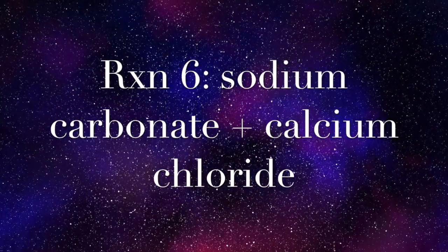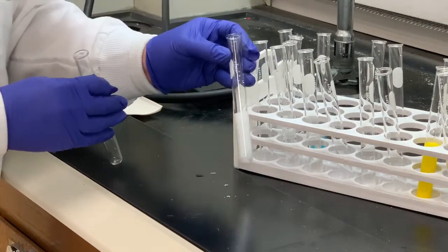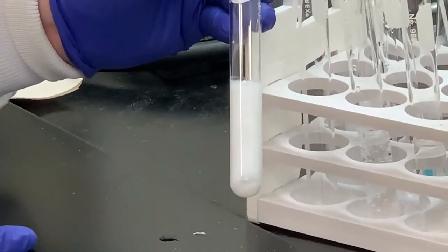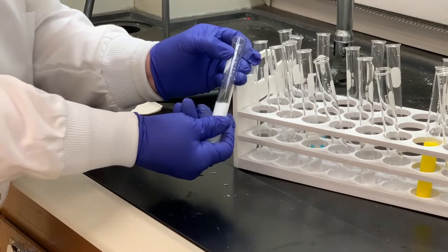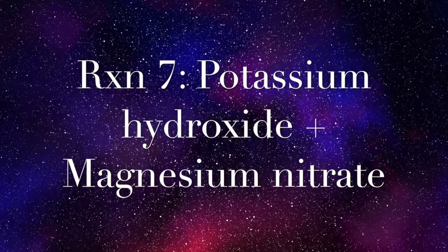The next set of reagents we're using is the sodium carbonate and the calcium chloride. Again, two colorless solutions. We will mix one to the other. And notice we're forming another white precipitate. This particular precipitate, if I compare it to the first one, looks almost more like cotton. There is a little bit of a difference in the consistency of that precipitate compared to the one that we just formed. I didn't see any bubbles rising to the surface. I don't notice a temperature change, but again, we formed this white precipitate. Did a reaction occur? You would say yes. The next two solutions are potassium hydroxide and magnesium nitrate, two colorless solutions.